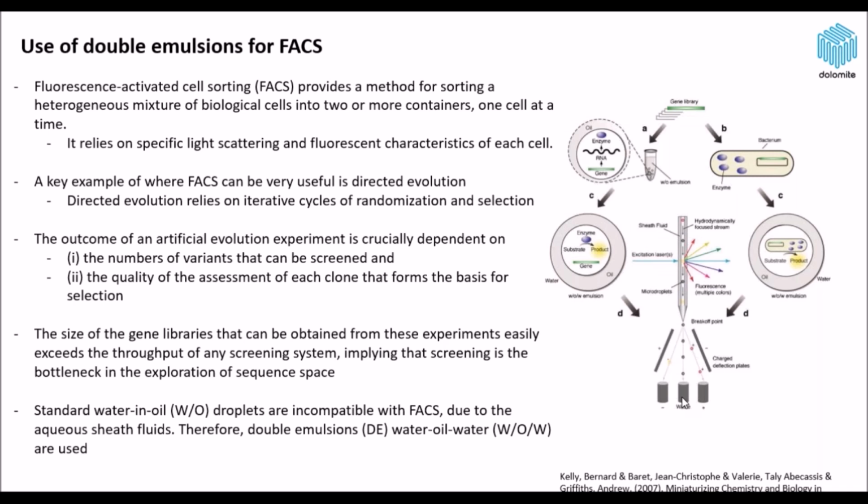Once you have your droplets, you can have your transcription and translation going on in the same droplet. These can then make a substrate fluorescent if the correct gene is present. And if that's the case, then you can immediately sort that through the FACS sorter into a collective population, which you can immediately analyze downstream, allowing you to have a genotype to phenotype linkage.